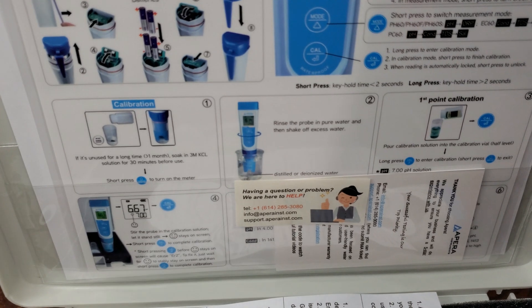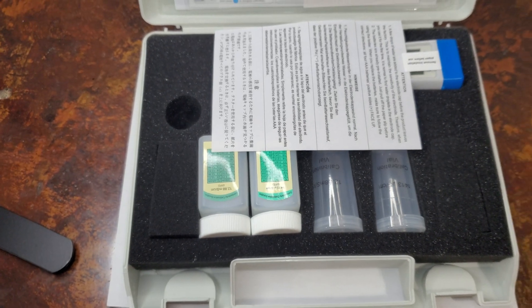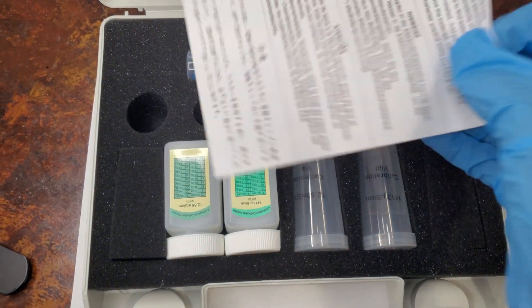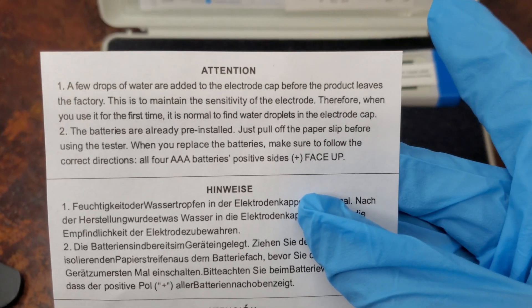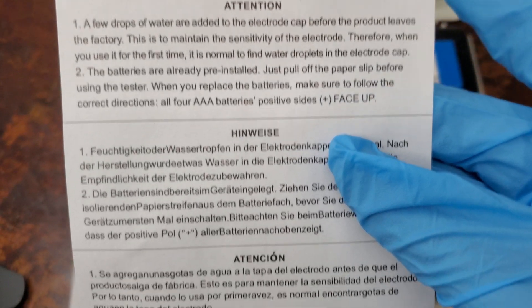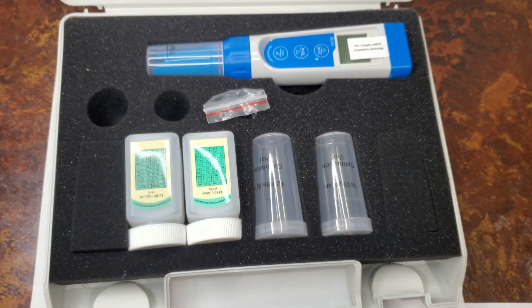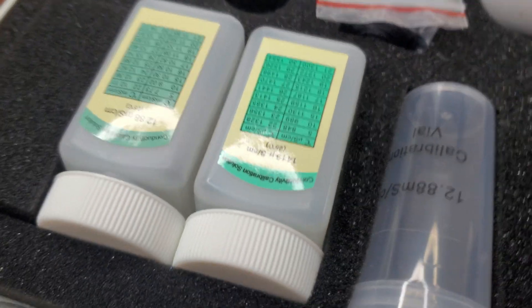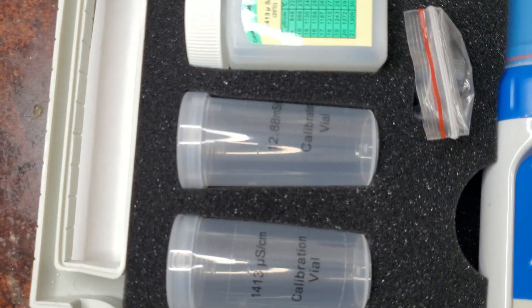They provide steps on how you can calibrate your device. Read this prior to using your new EC meter. These vials or small bottles are provided for you to use with your calibration liquids.